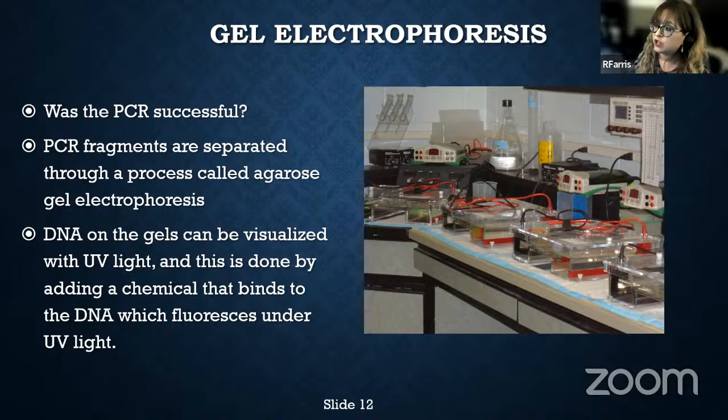Now, there are certain things that we do to manipulate the PCR because obviously it's clear. We need to be able to see it. We add dyes. Another thing we do add is a chemical known as ethidium bromide, which does just so happen to be a carcinogen, but we do work on it quite often here in our laboratory.